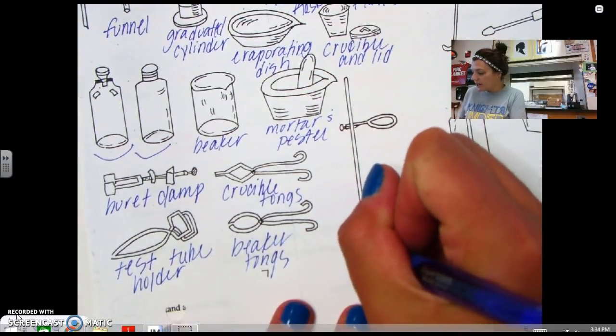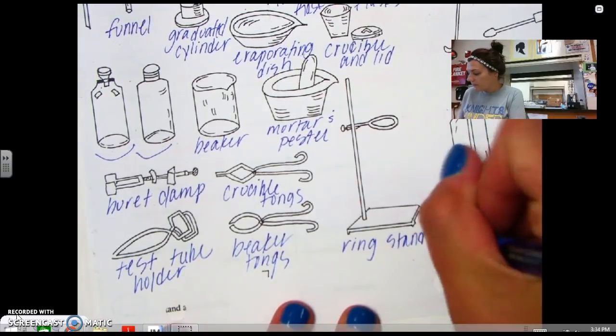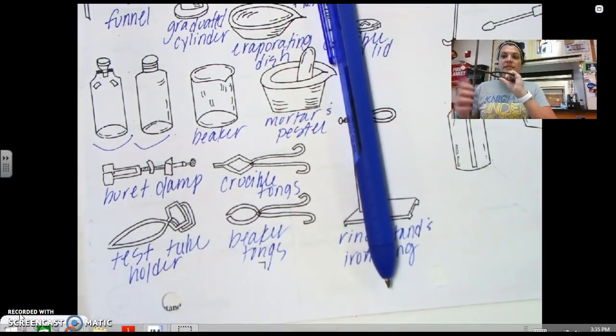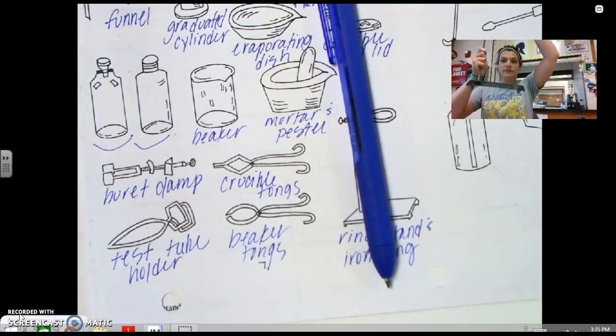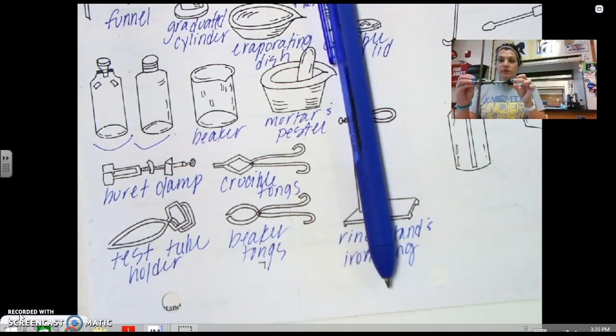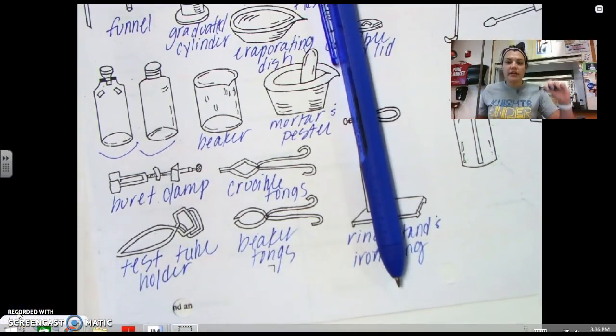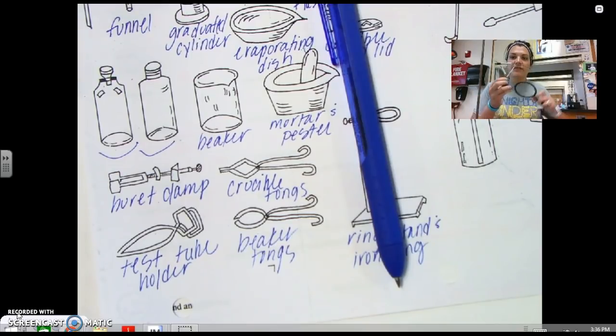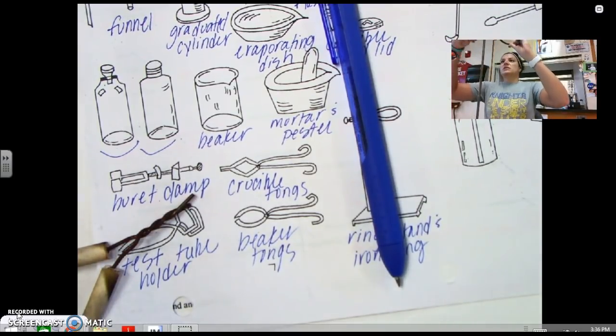The next thing is our ring stand and iron ring. And what these guys are used, so the ring stand is actually the thing that we put, can put multiple things on. So it kind of looks like this. And the ring stand obviously can hold our burette clamp like we talked about before. So this guy can go on to like this. And it can also hold our iron ring. Now our iron ring can hold something called a clay triangle, which we're going to get to here in a second. So I'll just show you here. So obviously I'm not going to use this iron ring to hold this beaker because it's a little bit flimsy.